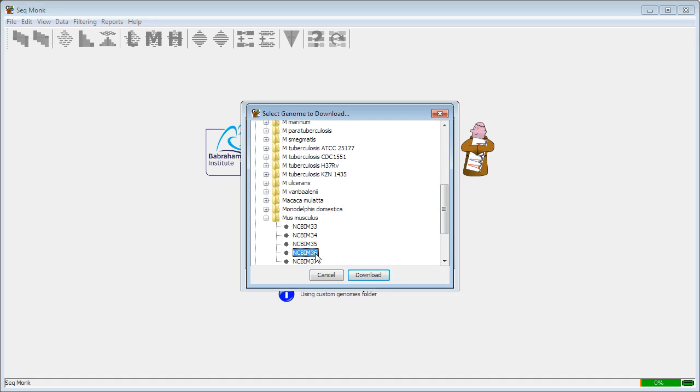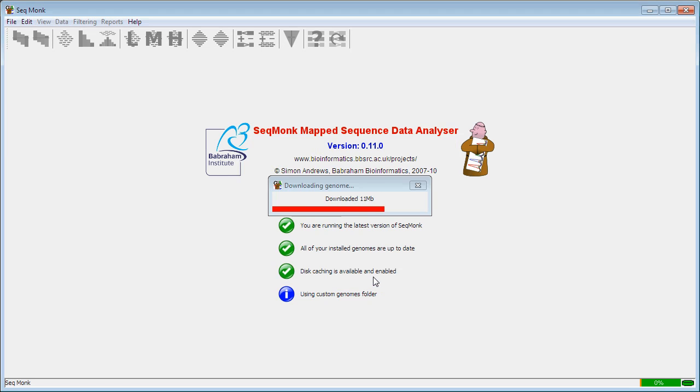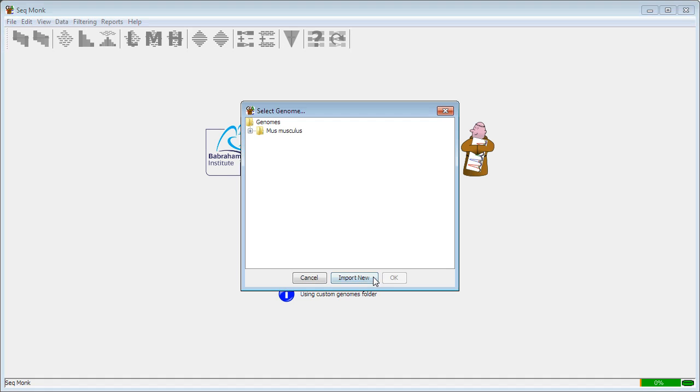It's important that the assembly that you choose here is the same as the assembly that you mapped your data against in the first place. I'm going to download this and then I get taken back to my initial genome selector and I can select the genome I've just imported.